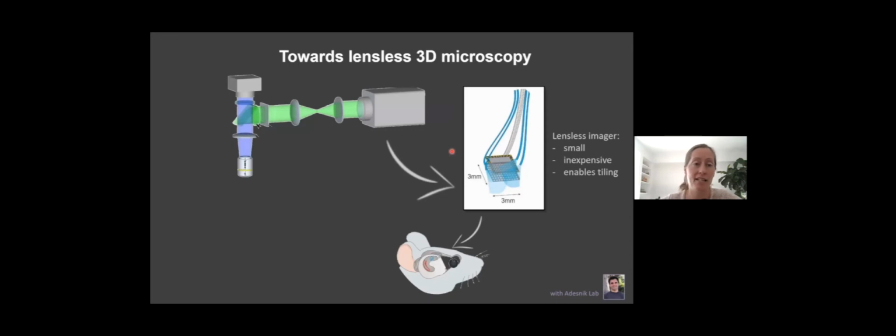One of our applications that we're going after is trying to take a big, heavy microscope and make it compact and head-mountable on mice, so we can track their neural activity in 3D at millisecond speeds while they're running around and performing behaviors. We work with a neuroscience lab, Hillel Adesnik's lab, that decides which neurons they care about and what they want the mouse to be doing while they're watching its neurons fire. This is a great candidate for that.